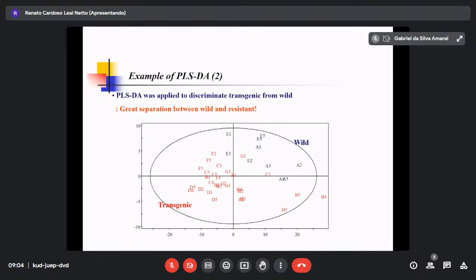Then at the end, statistical model significance is based on the number of samples. So if you delete samples, your number of samples will be very low. And when your number is always small, if you divide it in half, then it is very insignificant. That's why deleting, or dividing, is the last step.